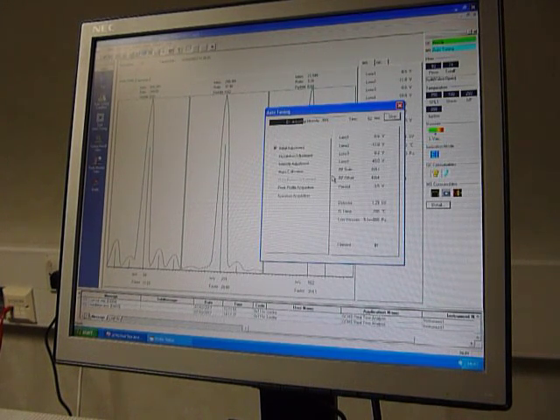It alters the lenses and things to get the maximum response and maximum intensity for each of these three masses. Once it's calibrated, you know that any masses between 50 — they can go lower than that, probably down to 10 — and 671 are where they should be. At the end of the day, when it's complete, you'll get the updated tuning file, the time, and the increased abundance.